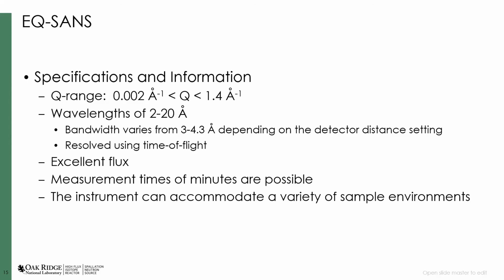The EQ-SANS does a bit of rheo-SANS work. So we have a rheometer that we frequently mount inside the sample area. We have your standard sample changers, much like everybody else does. But we also have a recent acquisition of a tensile stage, which is well suited for studying soft materials under stress and strain. And that's been in the user program for not terribly long, certainly less than a year. And I think that's going to be a great addition to the user program.